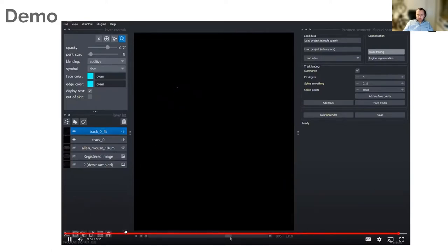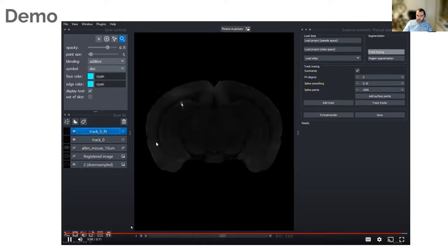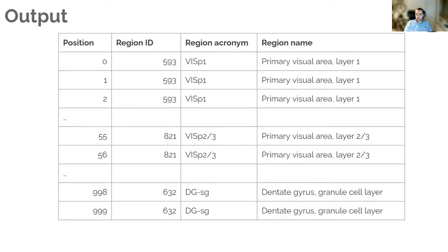Even if your probe is perfectly straight within the brain and hasn't bent at all, often you'll find that the probe in atlas space is actually bent because there's some non-linear warping between your raw data and the atlas.